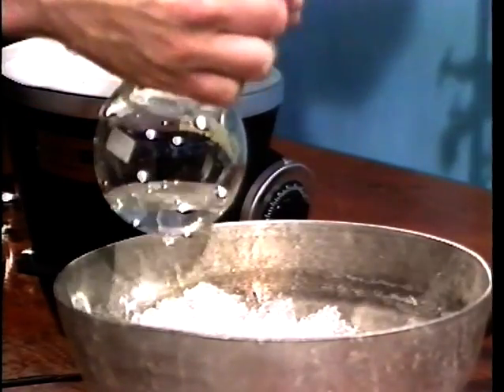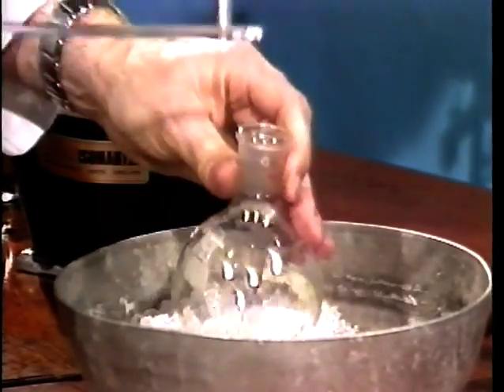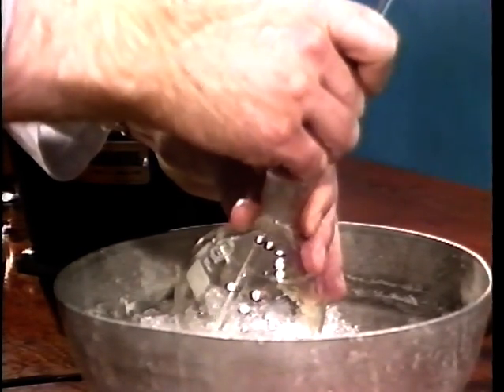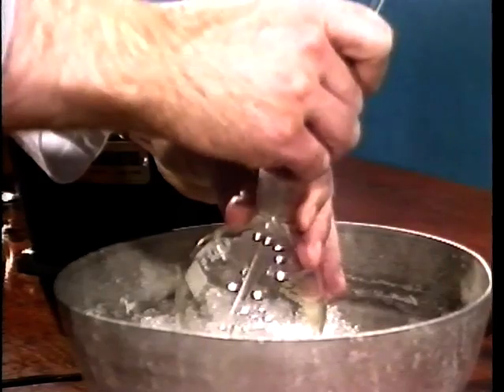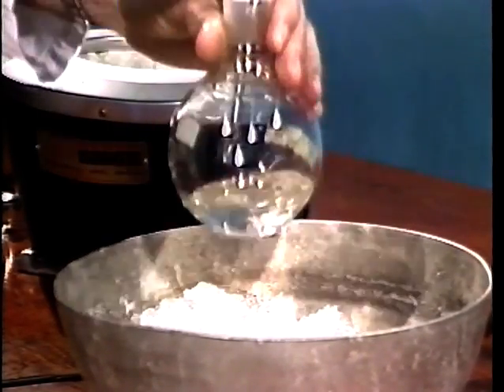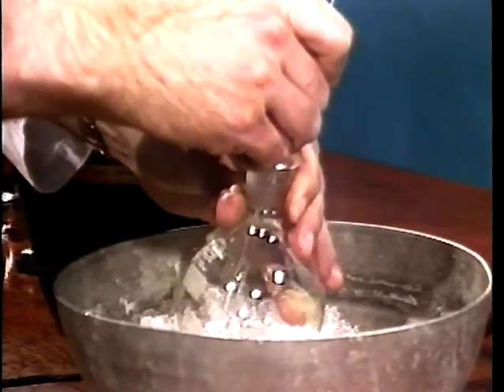Again, if crystals do not appear rapidly, you will have to resort to scratching the inside of the vessel with a glass rod. This may take a little while to induce recrystallization, but do not be impatient and do not poke the glass rod through the bottom of the flask.